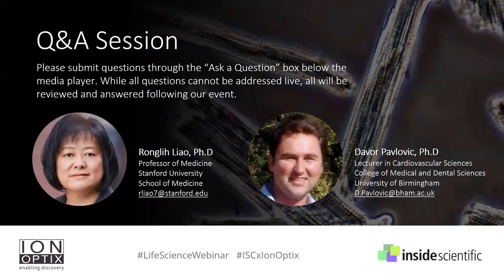Perfect, great answer. Now, next question: does mincing by scissors and trituration by transfer pipette damage or tear the myocytes? Davor, what's your experience with this? I mean, it definitely does. Yes, absolutely.